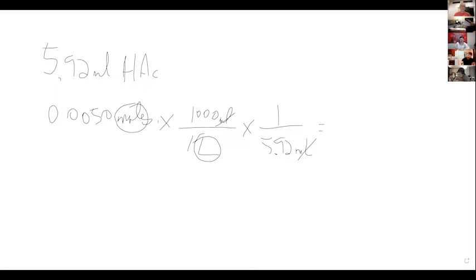0.005 times 1,000 divided by 5.92. And I come up with 0. Oops, it got erased. 0.845 molar.